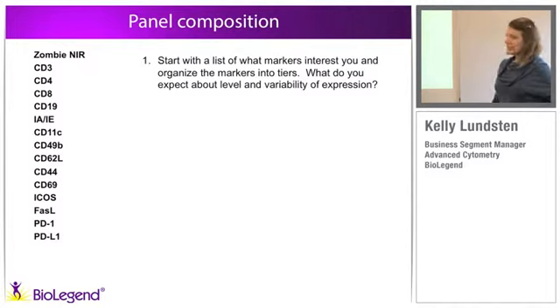All right, so here's a full list of largely markers that we got out of the literature that were implicated in this process.